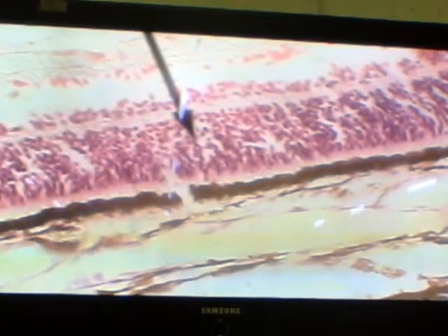Nuclei. You can see that. Look here. We have nuclei here too. And here we have nuclei as well. But you notice that there is a great difference between the first group and the last group. There's quite a big difference between the first group of cell bodies I showed you and the last group.